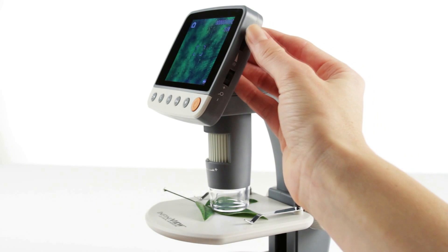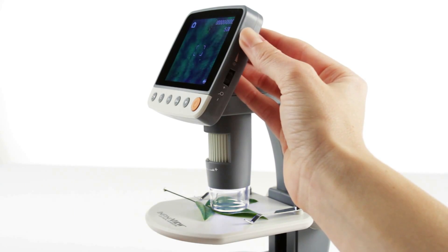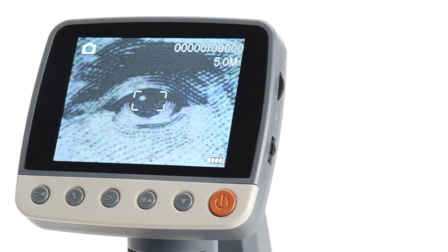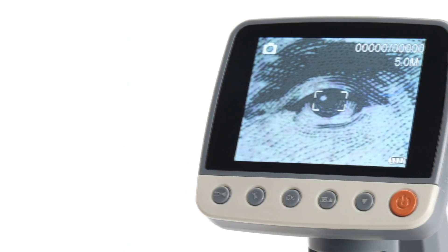You can adjust the LED illuminator to get the perfect view of your specimen, then save photos and video to the microSD memory card. InfiniVue's large 3.5-inch TFT LCD screen displays microscopic images with sharp contrast and high resolution.